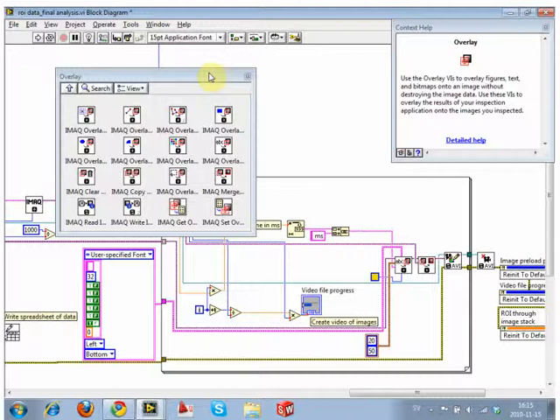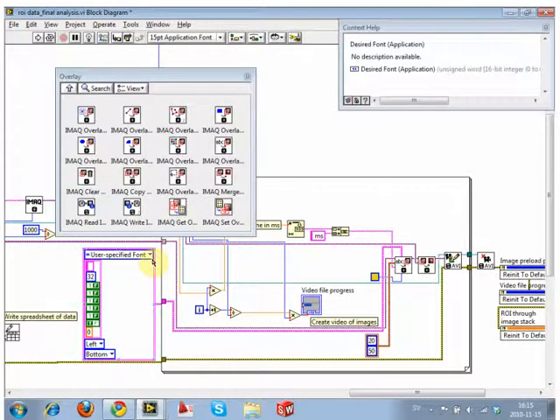Putting the new scale bars on the videos as opposed to just being on the first frame of the video is another one. The ability to just draw it on there, and it puts it on every frame of the image. Having certain measurements on there, because we're reading the intensity for a region, we can write that intensity on that frame. We can draw a box and say, look, we measured this region, this is the value for this region. We can pretty much do whatever you want. You can overlay bitmaps too, to be honest. You can overlay just about anything.